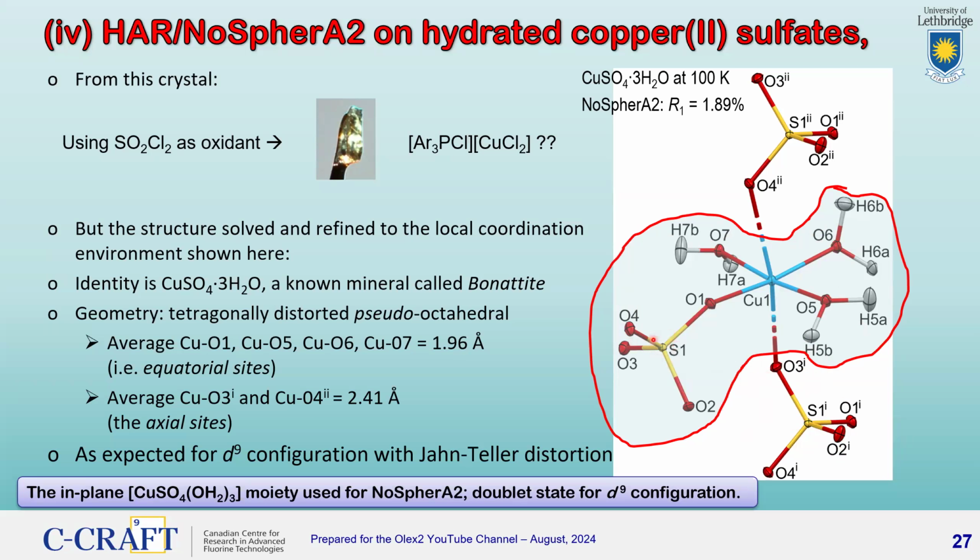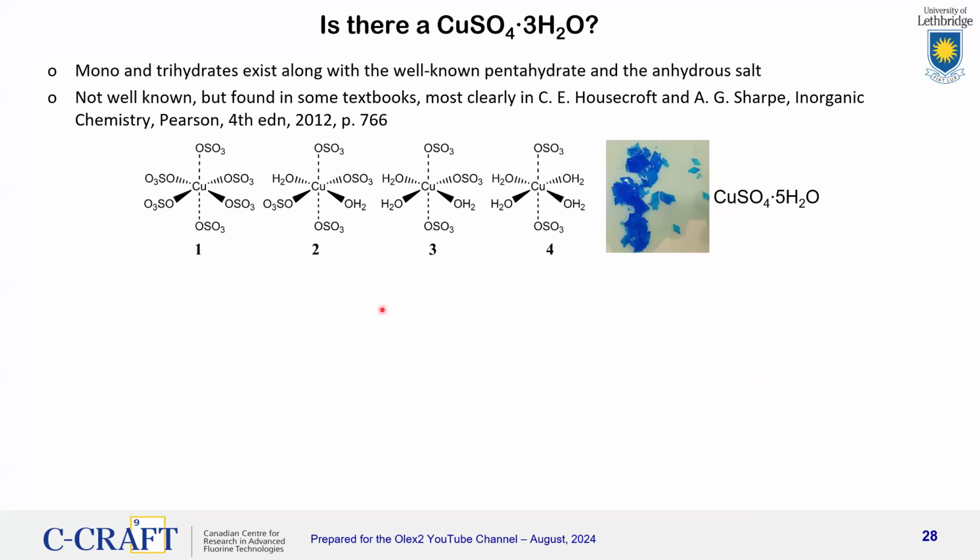They're just symmetry equivalent versions of the coordinated sulfur here that's in the plane, but these form these long Jahn-Teller extended bonds, and we could ignore those in the calculation. What we could not ignore is that copper(II) has a d9 electron configuration, so we had to specify a doublet electronic state in the calculation.